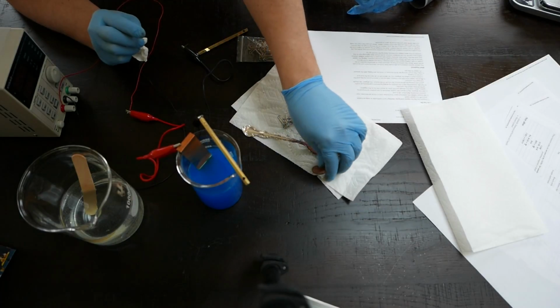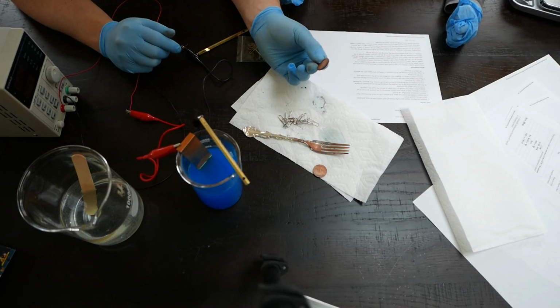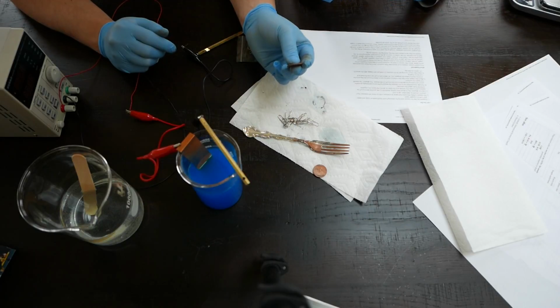Want to describe what it looks like? What does copper look like as far as the color goes? Bronze. It looks like bronze. Bronze is made out of copper.